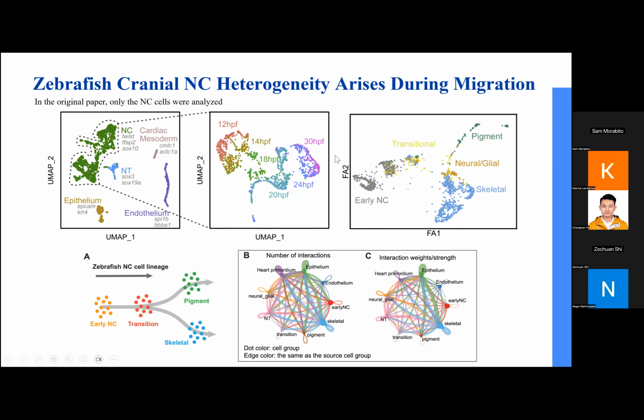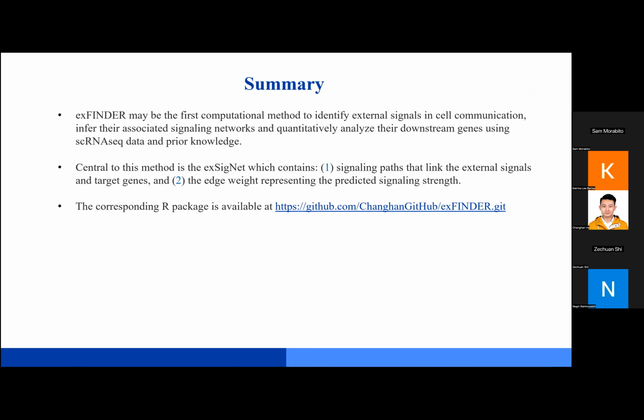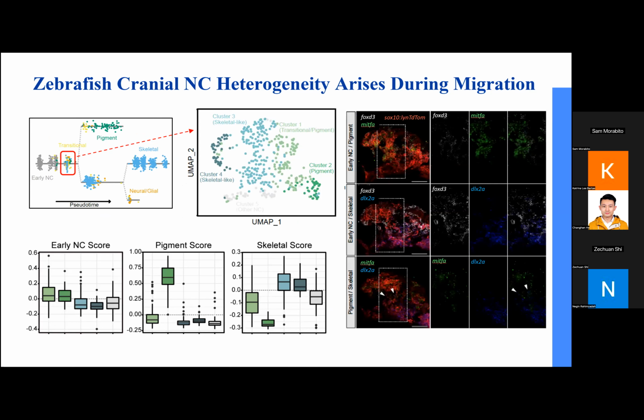So in this data, all these cells are identified as transition cells, because these cells are very noisy. But can we just put them all together and name them one single group, or is there a better way? We want to know if they should be identified as different subgroups. If we can identify different subgroups, we can discover multiple transition states.